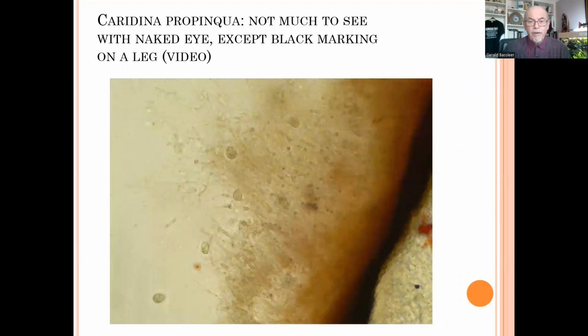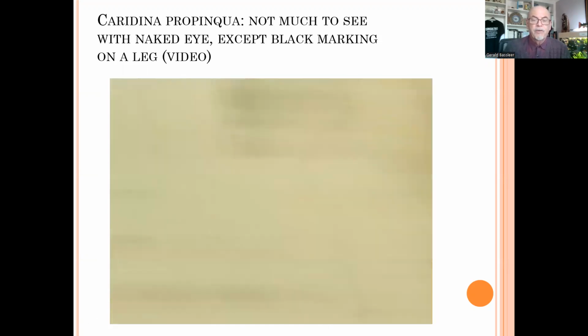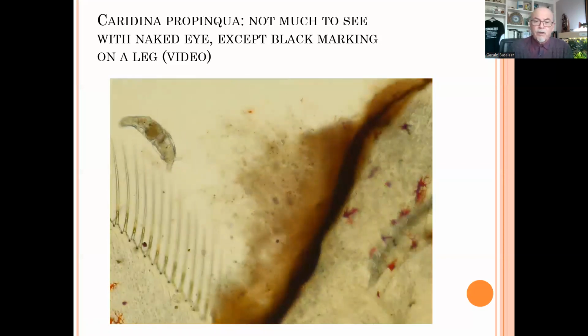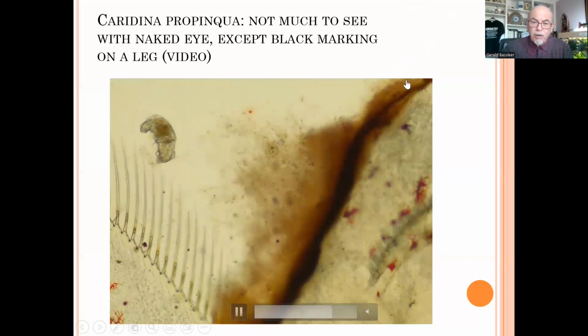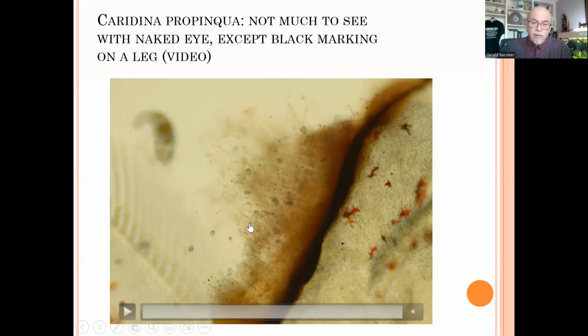And in the video, we saw already some fungal spores here, that's the threads here, and we saw some Tetrahymena parasites, which are a secondary invader, a cleaner, which is not necessarily the disease. The cause of disease is this necrosis here, caused by bacteria and secondary fungus. At the same time, we found a little crustacean animal here, which is normally available in our aquaria, in our water, which was just on the side here, but not a disease. That is something that sometimes occurs in a drop of water that you collect from the aquarium. But the main thing was that necrotic part here, rotting away of the paw and the leg, and at the same time, you could see fungal and parasitic secondary infections coming up.